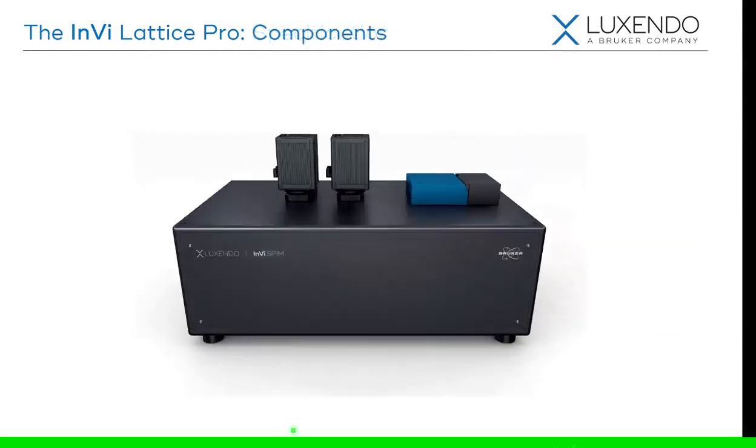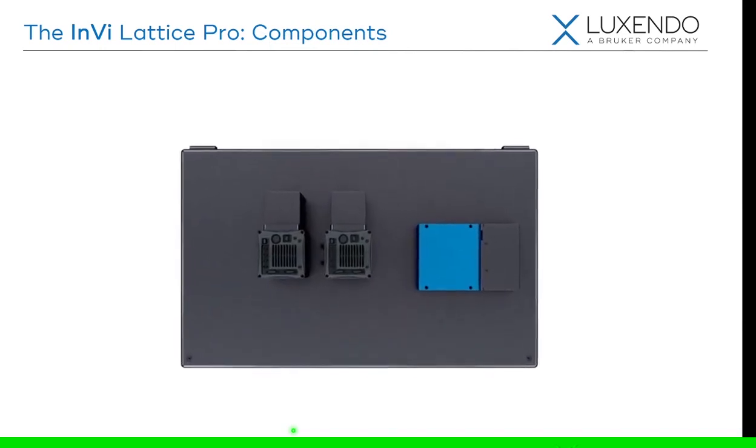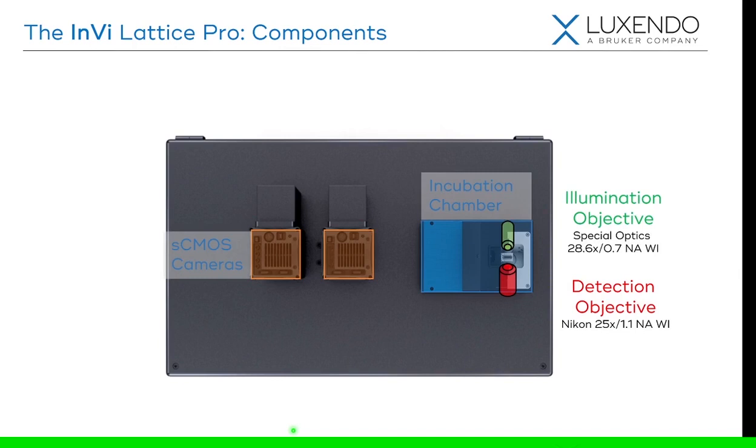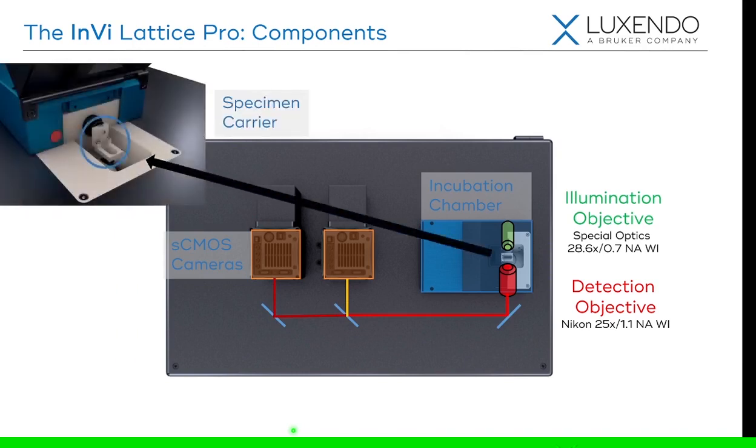To go over the system in a little more detail, we'll just go over the components individually. We have our incubation chamber as highlighted there, and the two scientific CMOS cameras, single illumination objective, single detection objective, and the two cameras for two-color simultaneous imaging. This is an inverted geometry, an inverted light sheet, and so the specimen carrier is a little bit different than what most people are used to. So I'd like to take a slide and go through that.